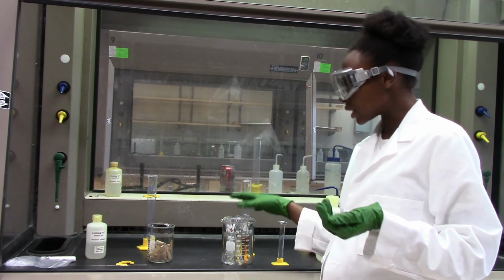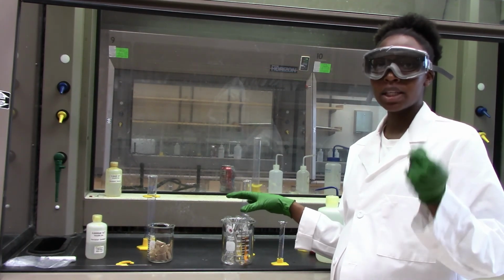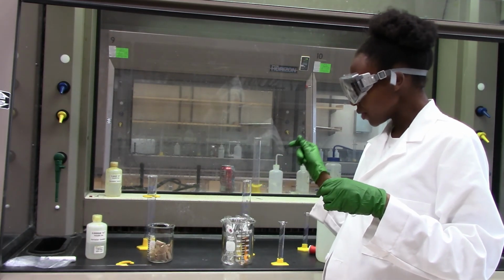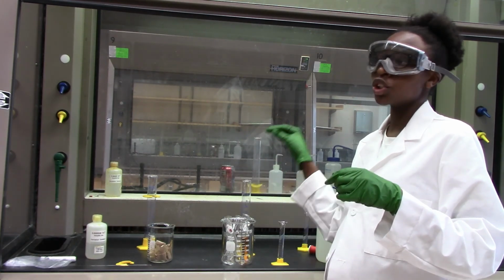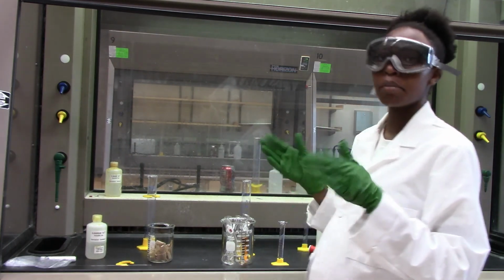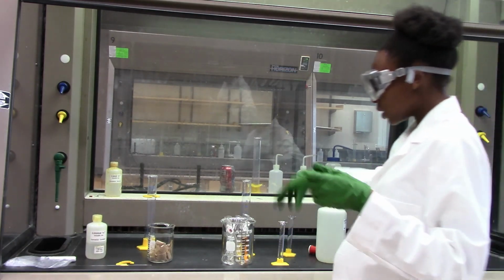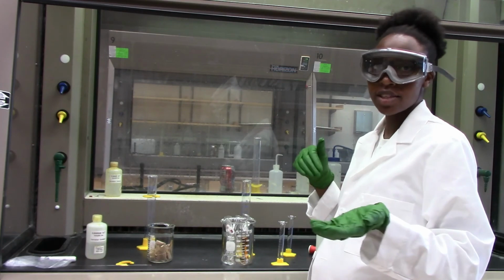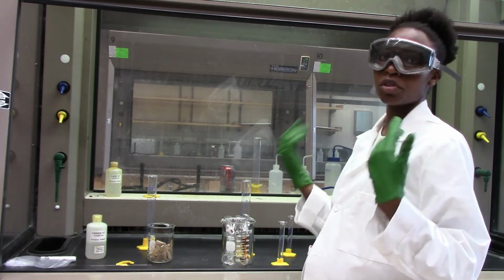So by the end of it, I have to make sure that all my 5 test tubes have a 10 milliliter final volume. So for the ones where I'm adding less of the thiocyanate, I'm going to top up with water, filling it up to 10 ml final volume using deionized water. So I'll start adding in the thiocyanate and topping it up with water to make sure that I have a final volume of 10 ml.